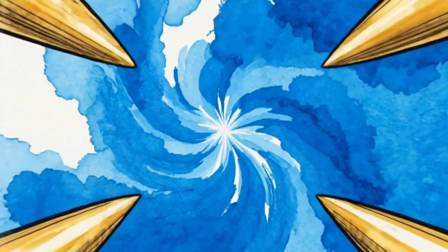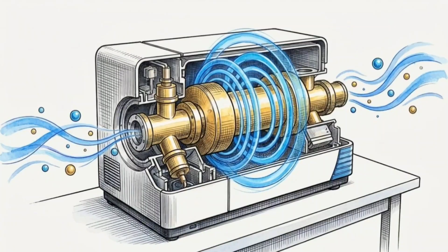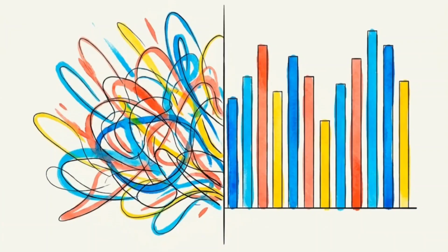Compact, robust, and mathematically precise, the Quadrupole Mass Analyzer proves that by mastering high-frequency electromagnetic fields, we can transform a chaotic stream of fragments into a clear mass spectrum, the definitive chemical signature of the world around us.